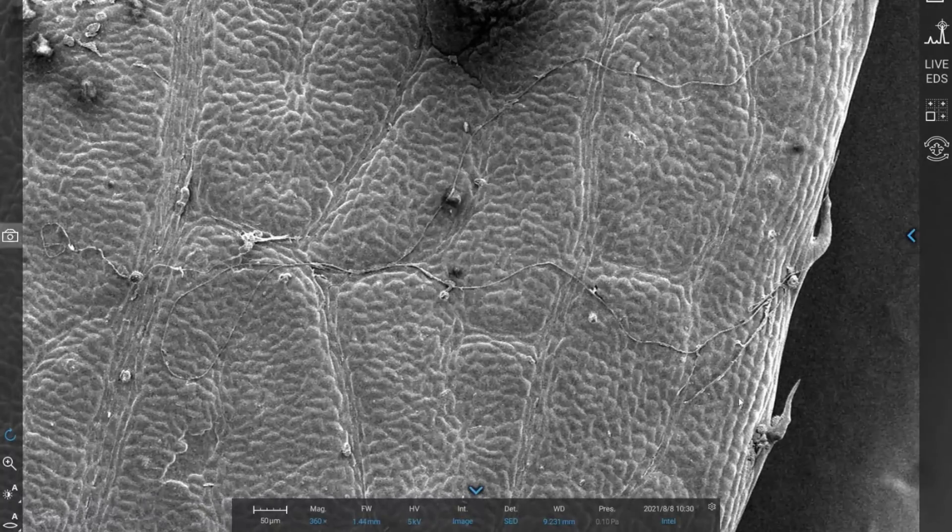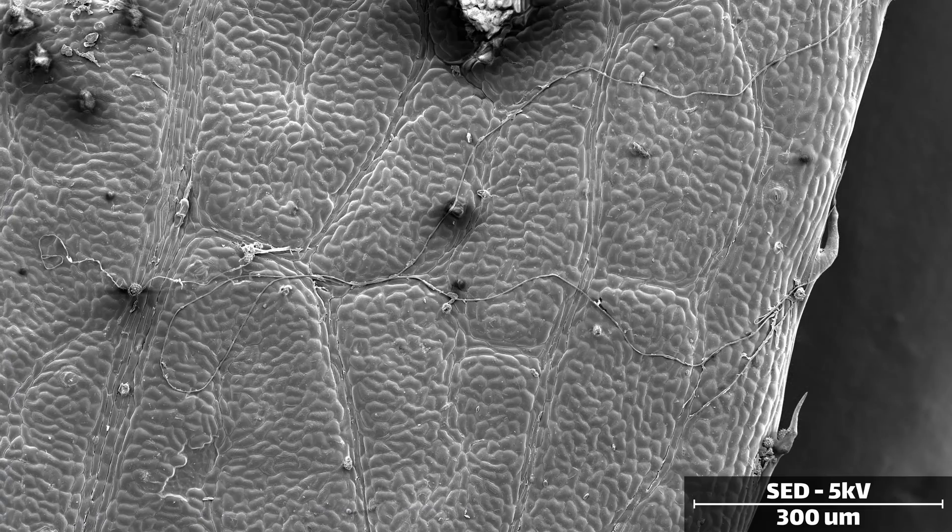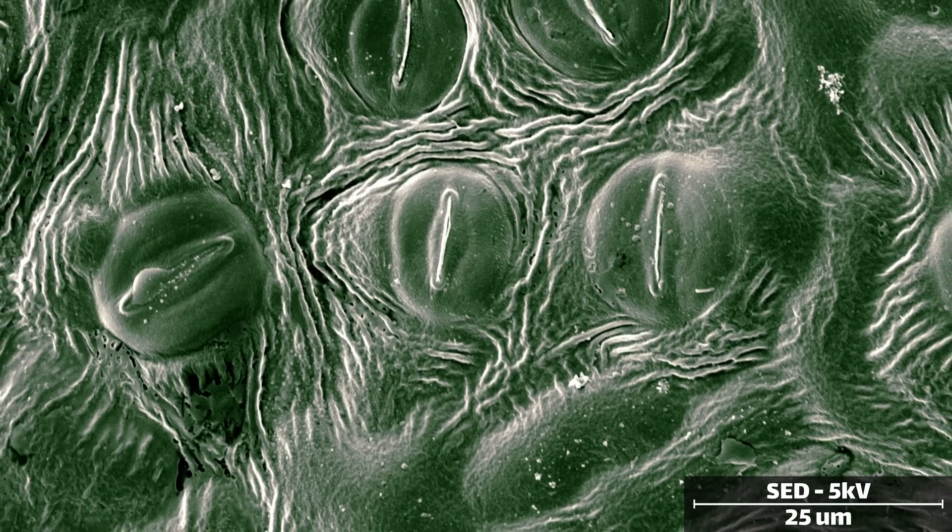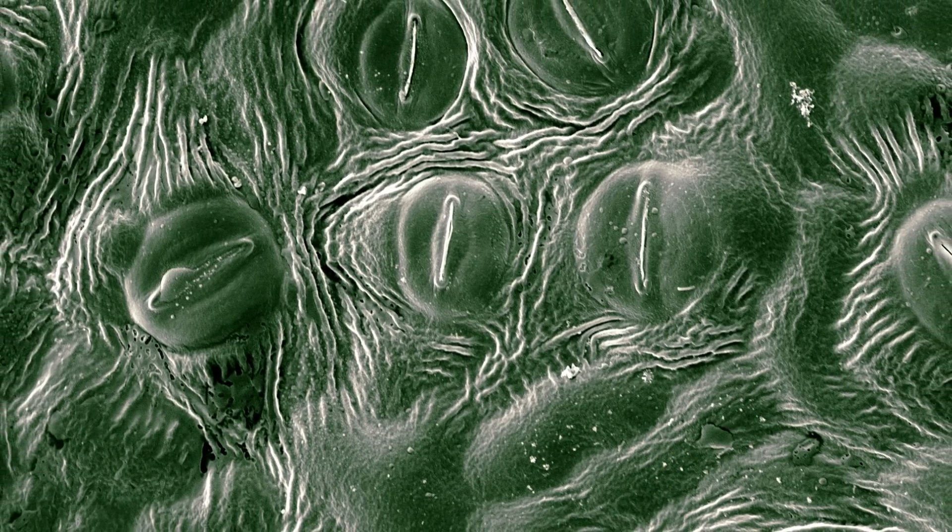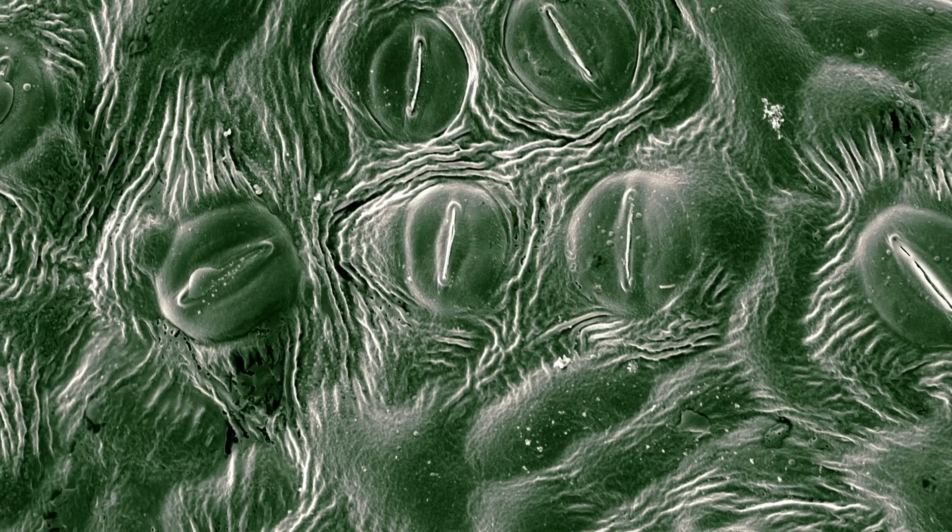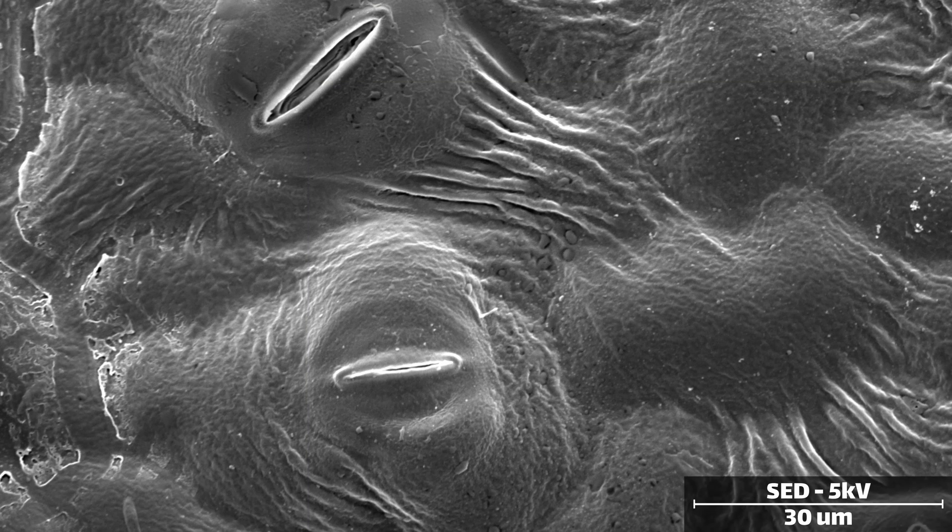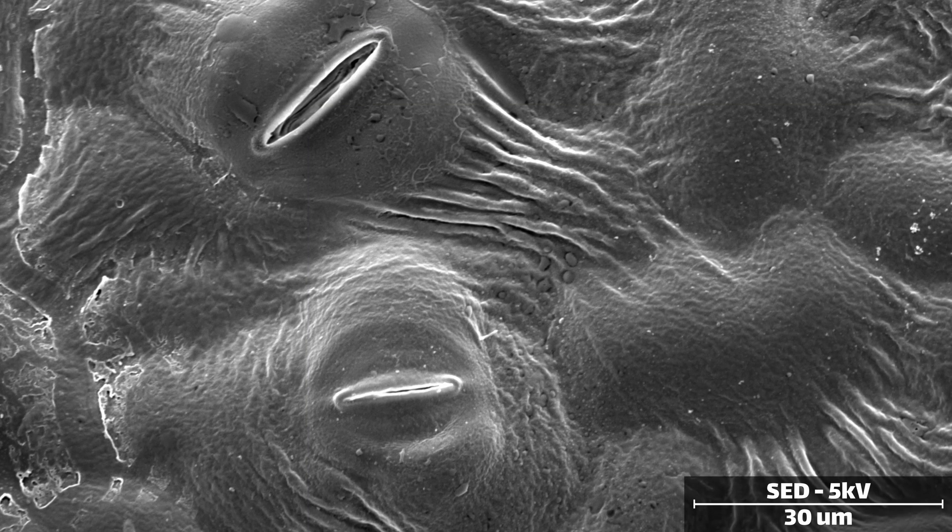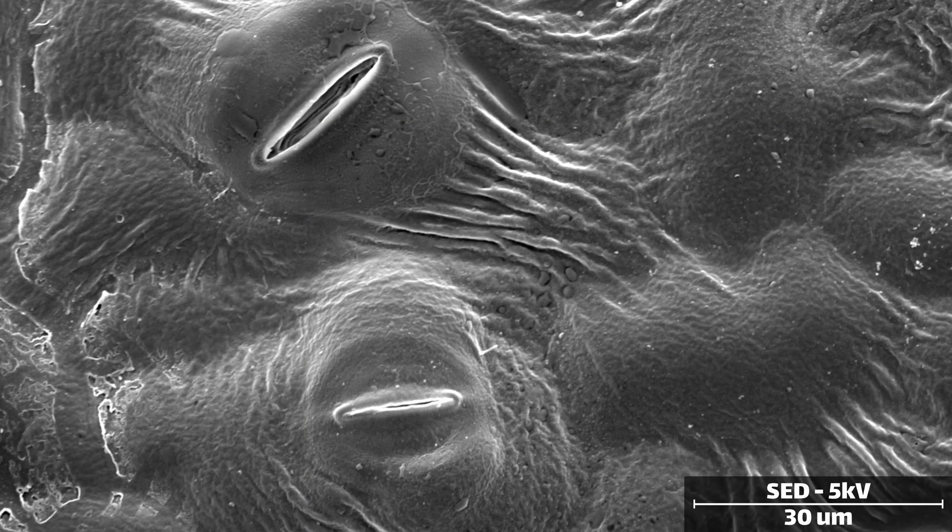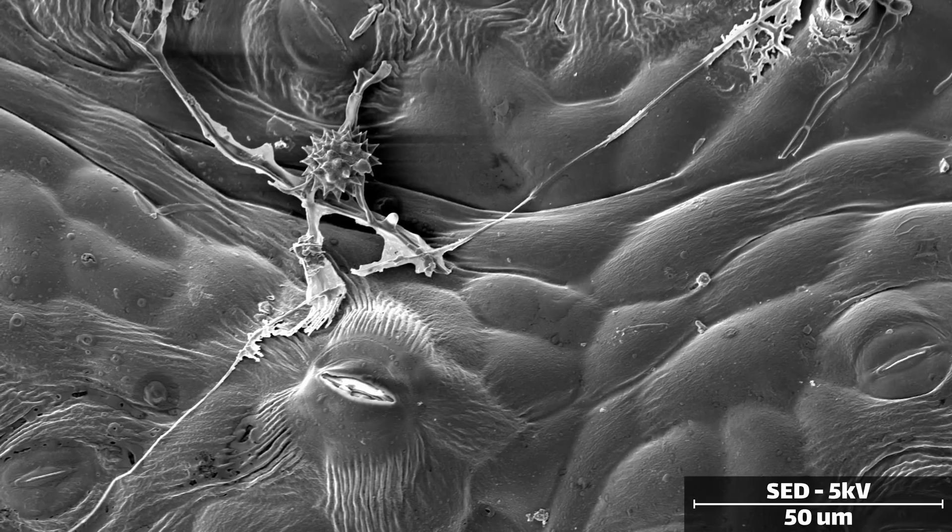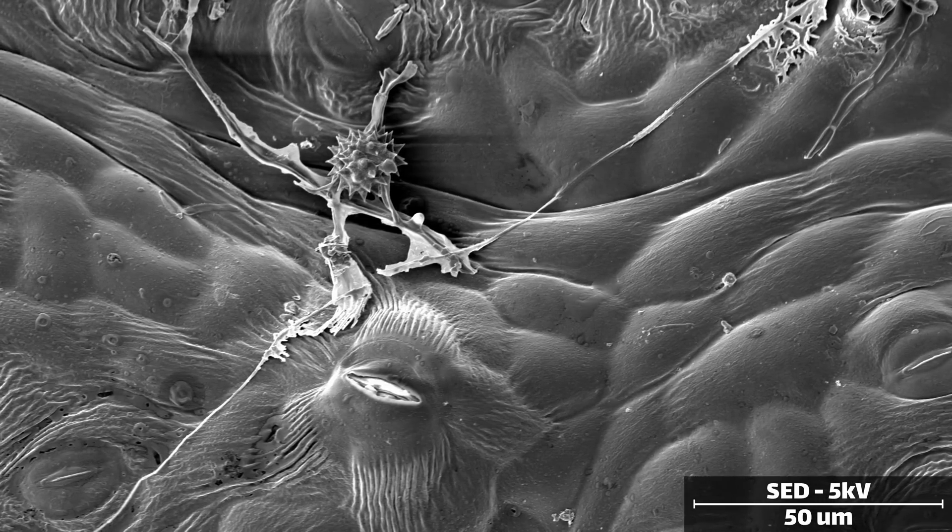On the underside of the leaf, we also see these mouth-shaped structures known as stomata. These structures help regulate gas and water vapor exchange. During periods of high humidity and a lot of sunlight, the stomata are open. But at night, or if the plant needs to conserve moisture during a dry spell, the stomata will close. Each stomata is actually composed of two bean-shaped cells, known as guard cells. They coordinate their behavior, swelling or shrinking, to open and close the pore.